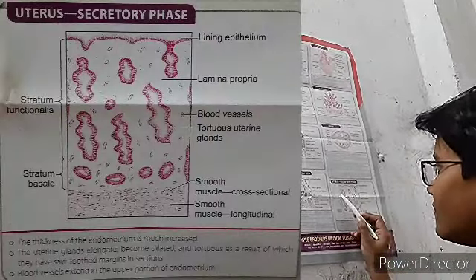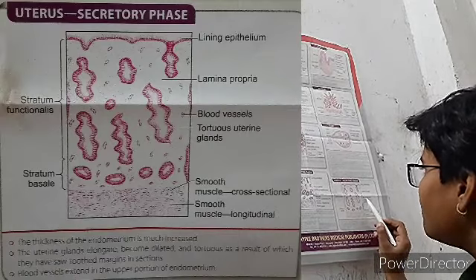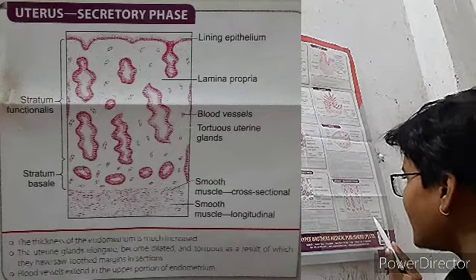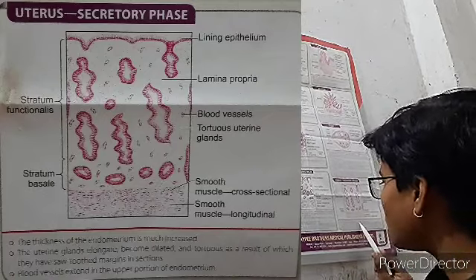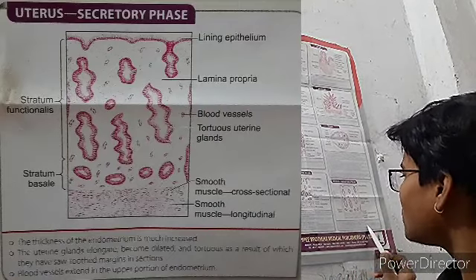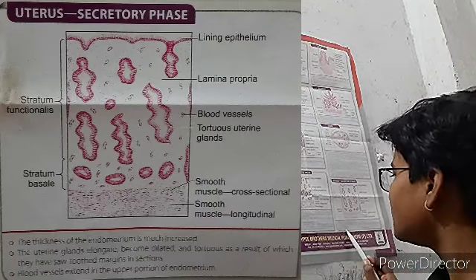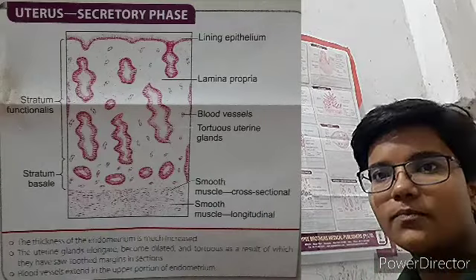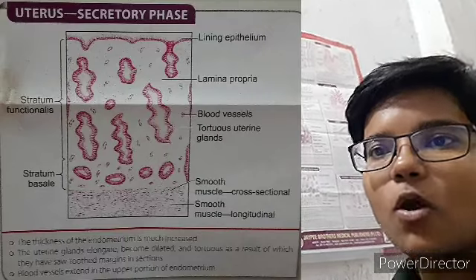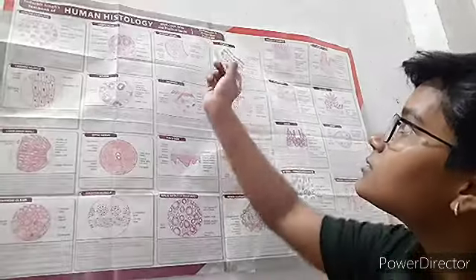Now the uterus in the secretory phase. Visible structures include stratum functionalis, stratum basalis, lining epithelium, lamina propria, blood vessels, tortuous uterine glands, smooth muscles in cross-section and longitudinal section. The thickness of the endometrium is much increased. The uterine glands elongate, become dilated and tortuous. The blood vessels extend into the upper portion of the endometrium. This concludes the human histology revision; histology slides are included in this video.